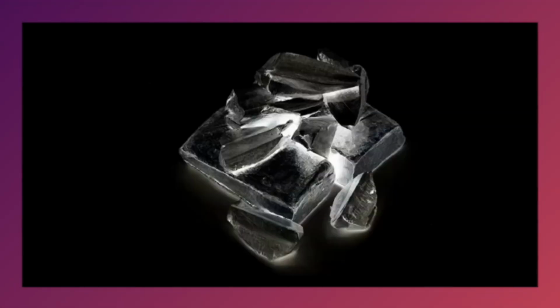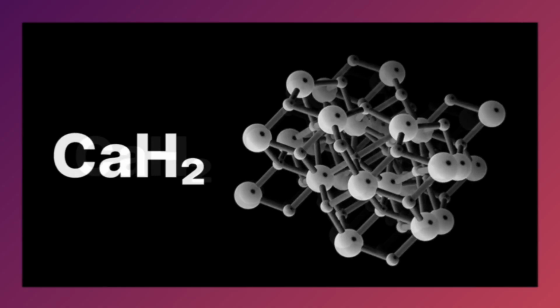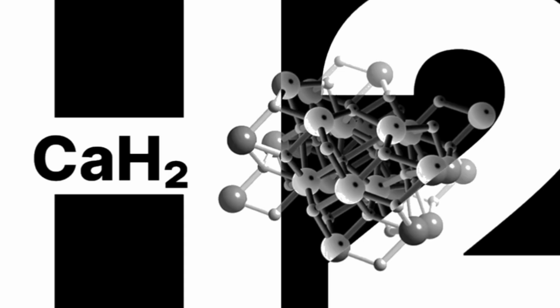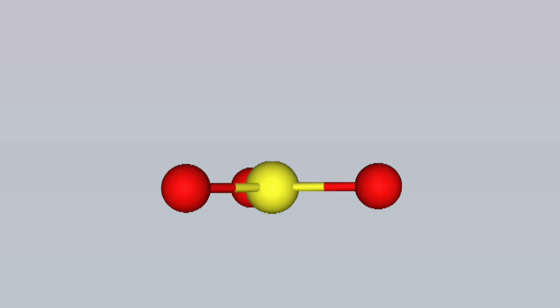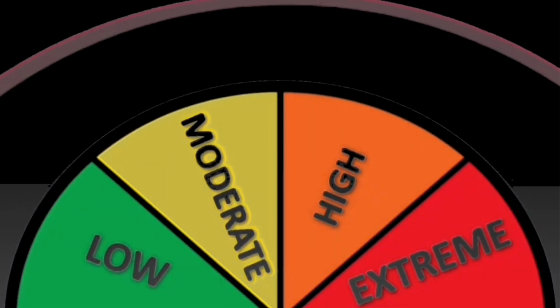Another strong and chemically reactive desiccant is sodium metal, which is used for drying ethers and hydrocarbons. Close in strength to phosphorus pentoxide is calcium hydride. This reacts with water to release hydrogen gas, making it another aggressive but useful drying agent. If we want something even stronger than phosphorus pentoxide, that would be sulfur trioxide, the compound we're making today. For sheer dehydrating strength, only sulfur trioxide surpasses phosphorus pentoxide, but it's far less convenient to handle.